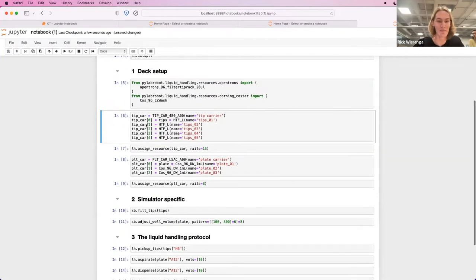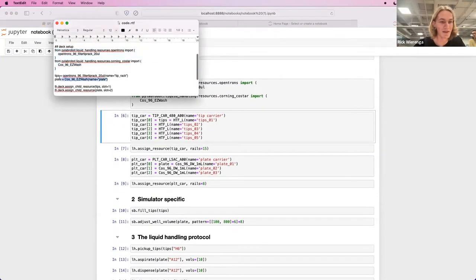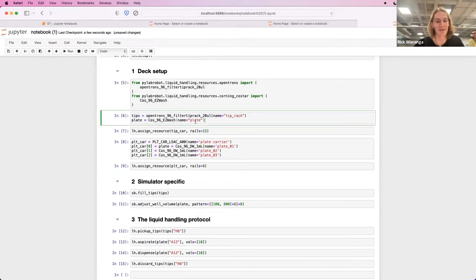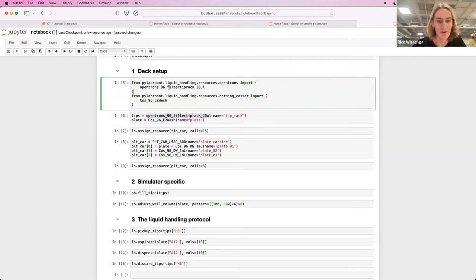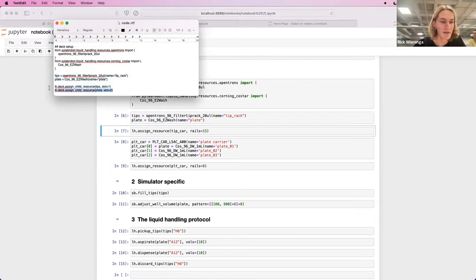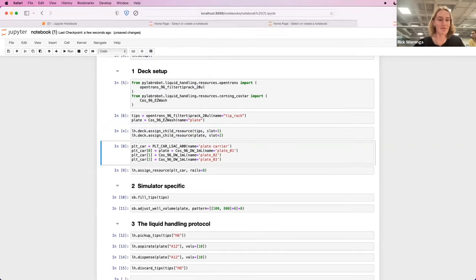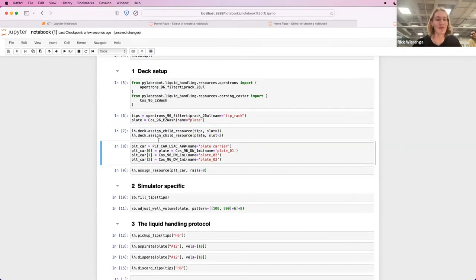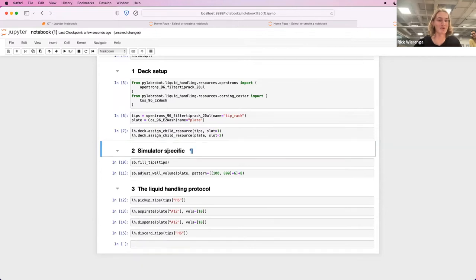And then instead of the carrier, we define the tips as the OpenTrons tips and then use the same plate. And I'll assign the resources to the robot. The resources are in the robot. I just have to tell PyLab robot that we have them.